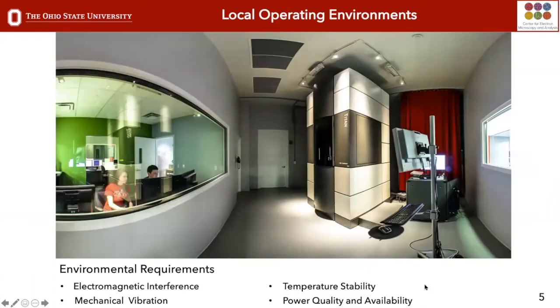And, with COVID, we were uniquely situated to continue providing the services that we have. One of the reasons that we were in that situation is we built our facility to essentially run under remote microscopy conditions. You can see in this picture that there are two students sitting to the left, and there's a microscope, this box off to the right. This is a Titan. This is what our Titan looks like. The microscope is built inside a box in order to protect it from the environment.